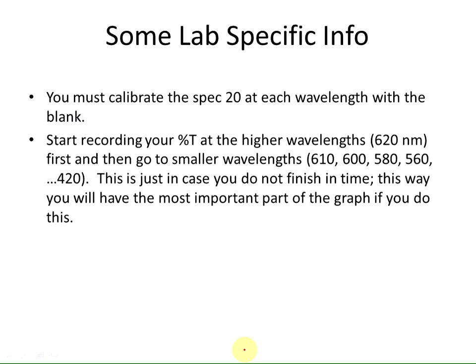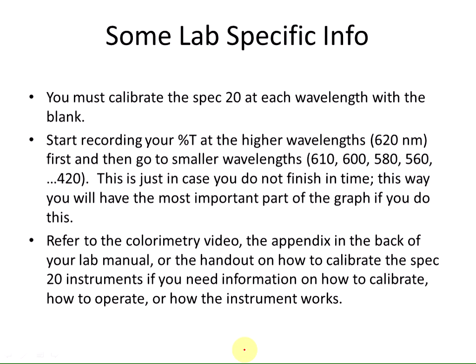If you need help on how to use the SPEC-20, such as how to operate it, how to calibrate it, or how it works, you can either refer to the appendix in the back of your lab manual, you can see the colorimetry video that's on YouTube, or you can see the handout that's posted on Blackboard, or it will probably be printed and placed next to the SPEC-20 in the classroom.